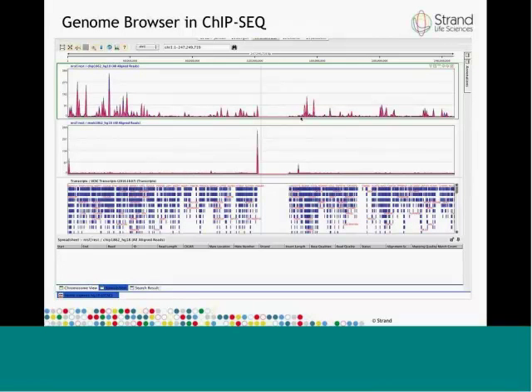Here you can see tracks from the ChIP sample and the control sample, and as usual the UCSC transcript annotations, because that is what the experiment was created with. If you take a look at these coverages, it looks satisfactory. There seem to be some tall peaks in several parts of the ChIP sample, and the control sample largely shows low coverages.